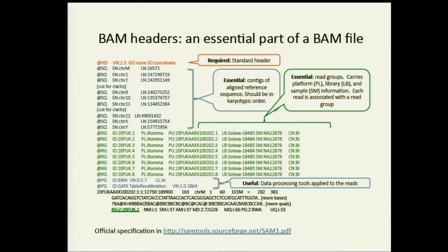This is the header of the BAM file. Before you actually have that sequencing data I mentioned, you have the header. Now, why are we showing you the header? It's because if you don't have well-formed headers, the GATK will barf on your file. It will say, go back, put the headers back in, and start again.